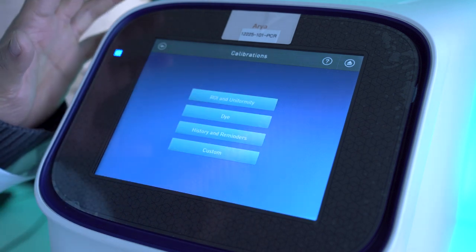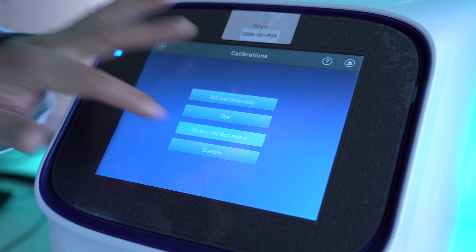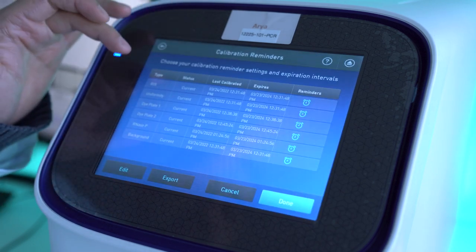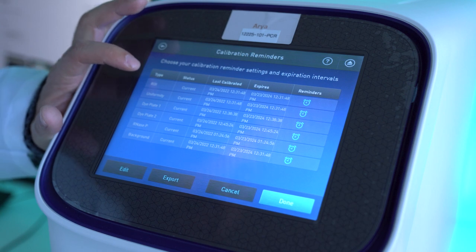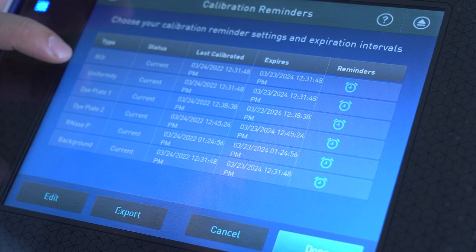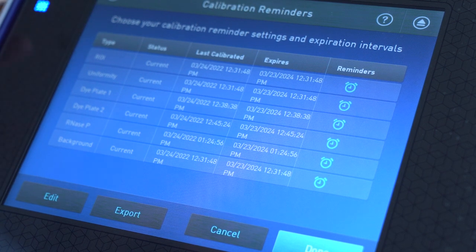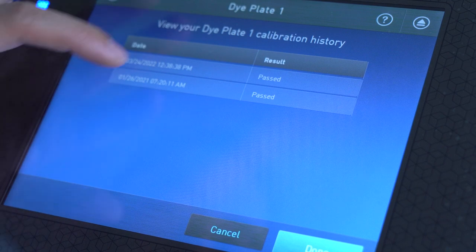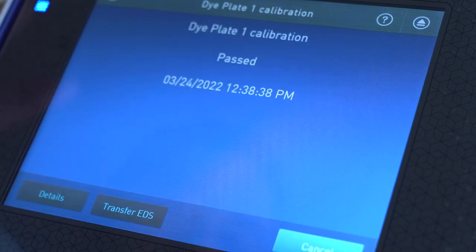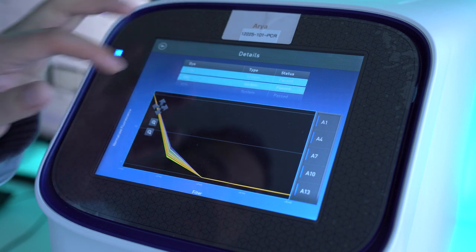If you want to see past results, you can click on History. You can see when the ROI was last done, the last time uniformity was done, and the last time the dye plates were calibrated. You can click on each of these and view the results — click on Details to view the results of each dye.